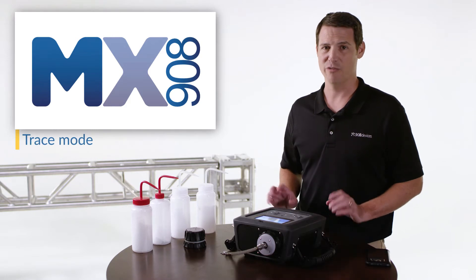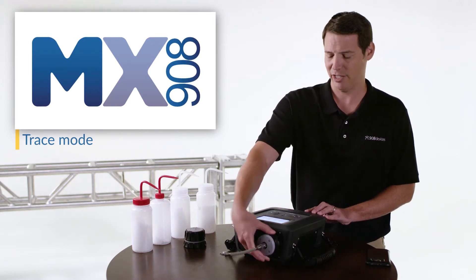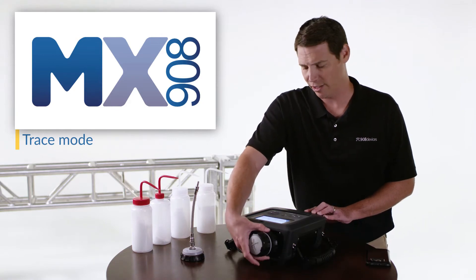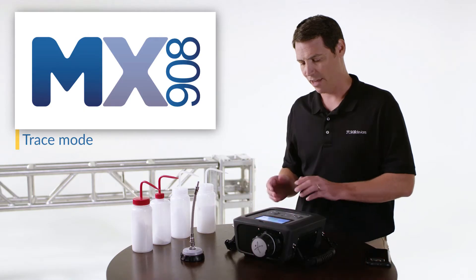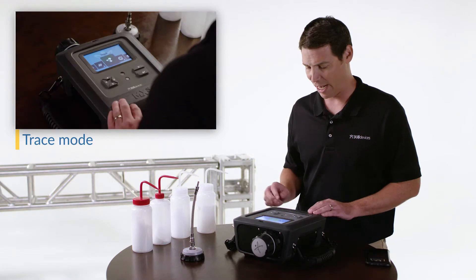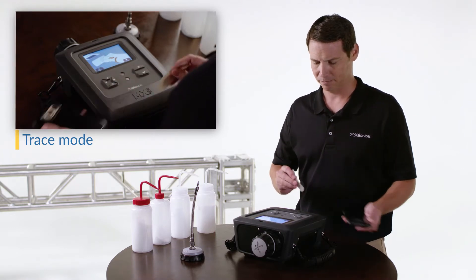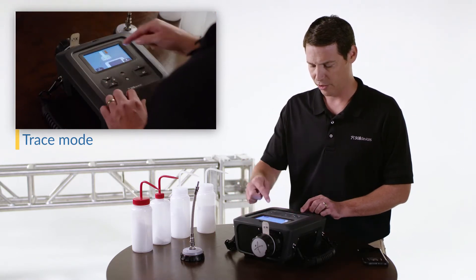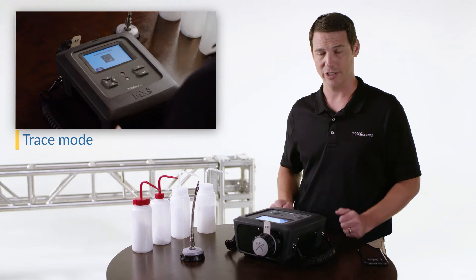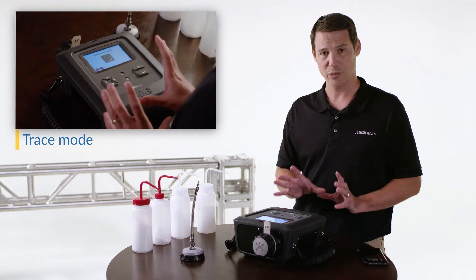Many targets have little to no vapor pressure, like explosives, drugs, and some warfare agents. MX908 is unique in its ability to identify threats in multiple phases. I can change out my sampling front end just like changing a camera lens, and the device is smart enough to know which sample module is attached. Now that I have my trace module attached I'm ready to begin a scan. I can swab my suspected surface here and follow the guidance to insert the swab, close the module, and start analysis. In about 20 seconds we're going to see the analysis begin as soon as we finish initialization.